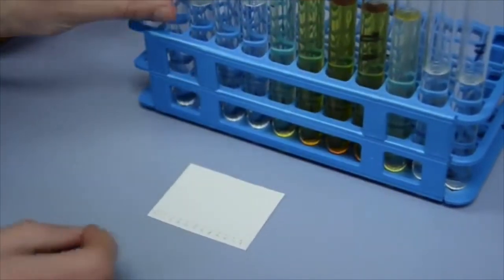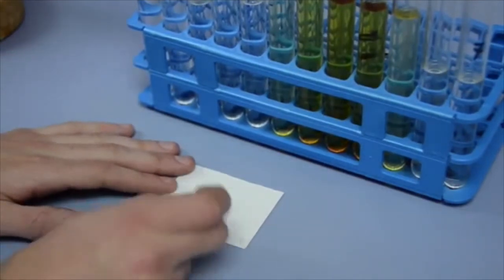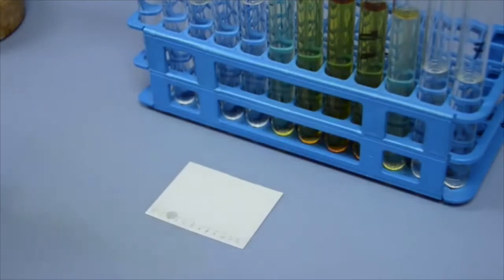You can also analyze samples through GC for more accurate determination of purity. The ends of each fraction should ideally be checked in this way.